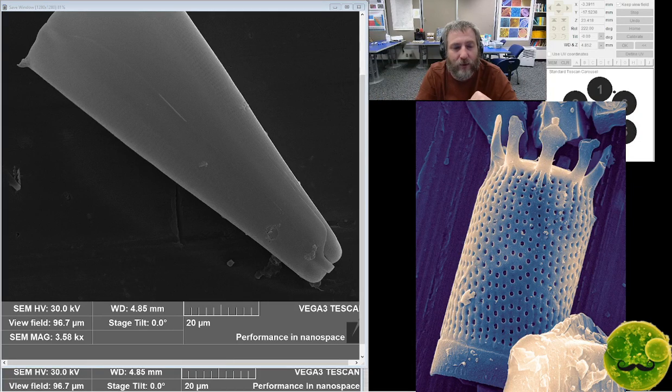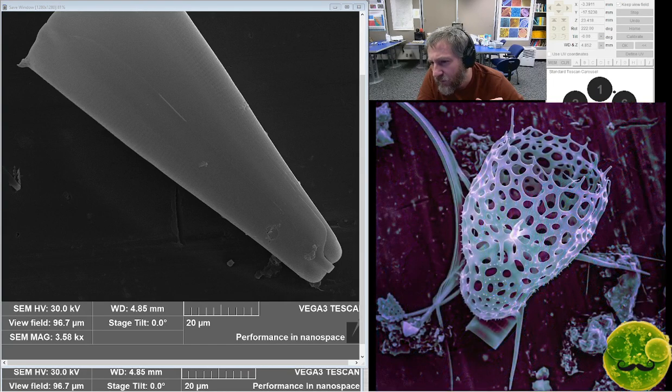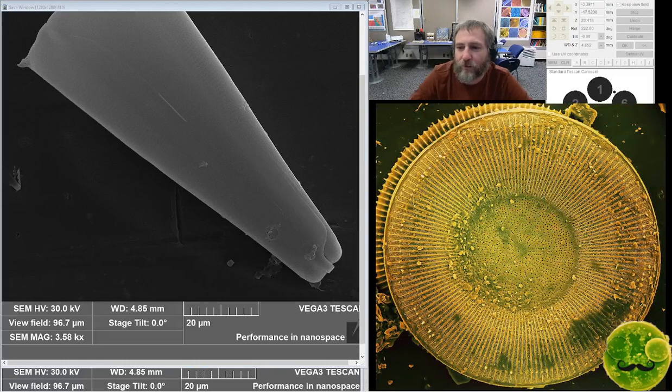So when you're done, rather than having an image, like the photograph we produce with a scanning electron microscope, with an atomic force microscope you have a 3D model. Okay. Yeah. It's a modified STM. It uses electron tunneling to image on an atomic scale. It requires the surface to be conductive. So does mine. Atomic force was developed for non-conductive surfaces. Okay. That's cool. So, excellent.